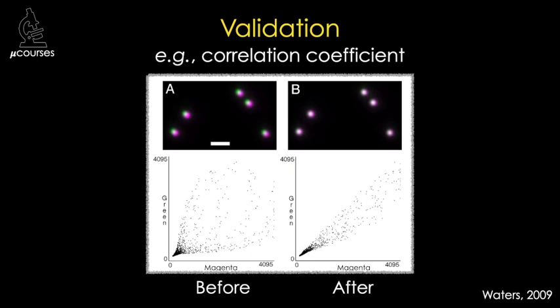It's also good practice to repeat the measurements on different days to make sure it's consistent over time. To validate, you can measure the change in co-localization in your test specimen before and after the correction is applied — I've done this here using a correlation coefficient. You can see that in this example, co-localization between green and magenta intensity values improved after the shift correction was applied.